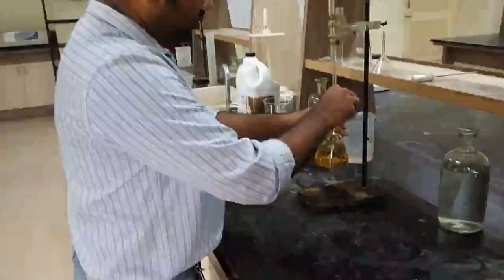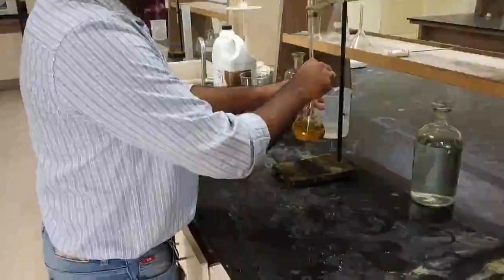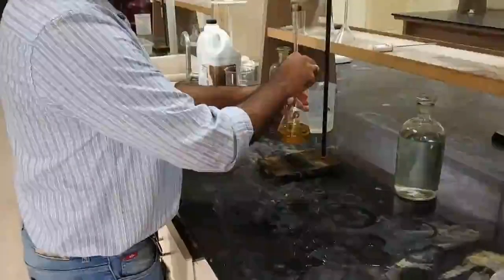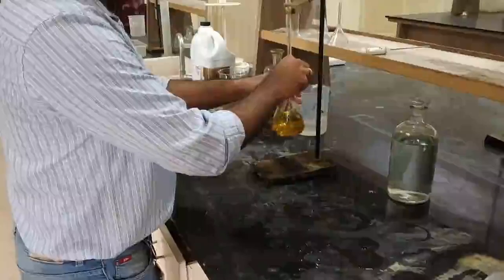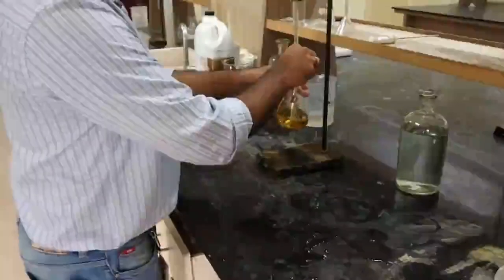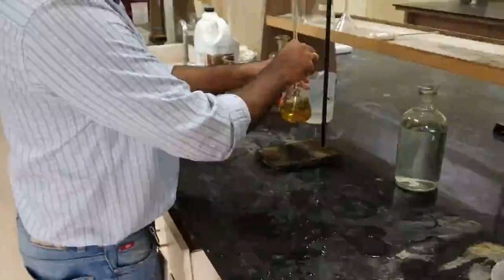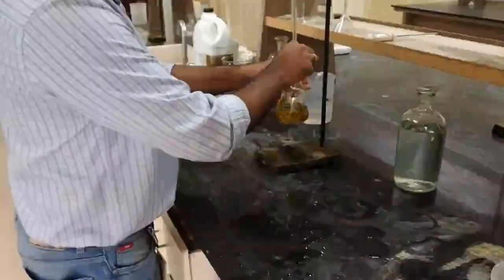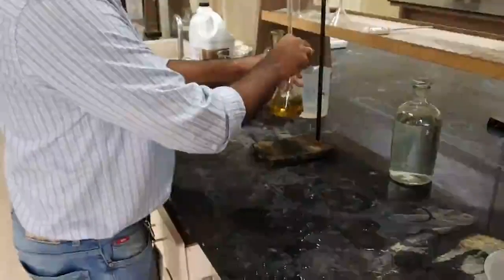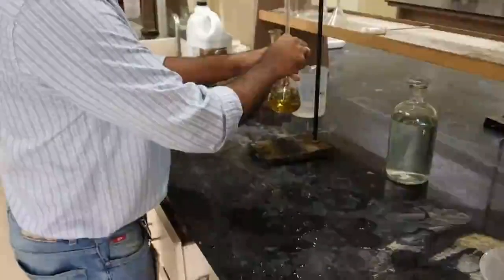The drop by drop addition and simultaneous stirring will be required. The end point of this is a stable brown color, right? There are various color changes that are happening. You can note down the changes as well which are happening. So now this is a yellowish liquid that we have.